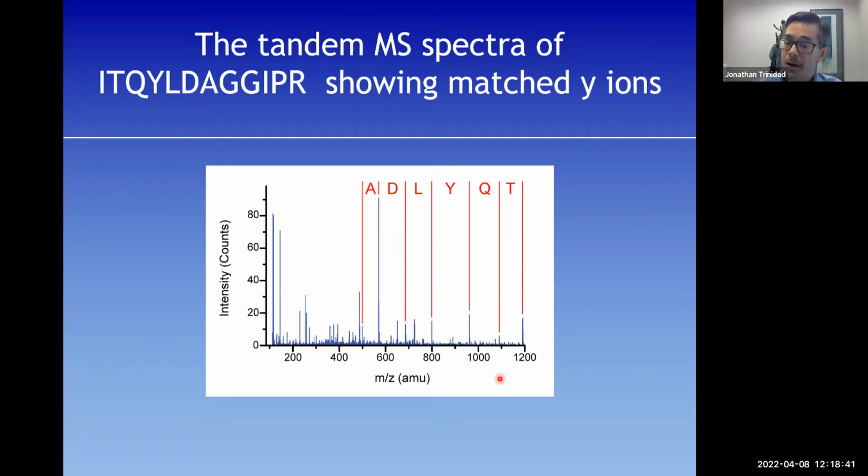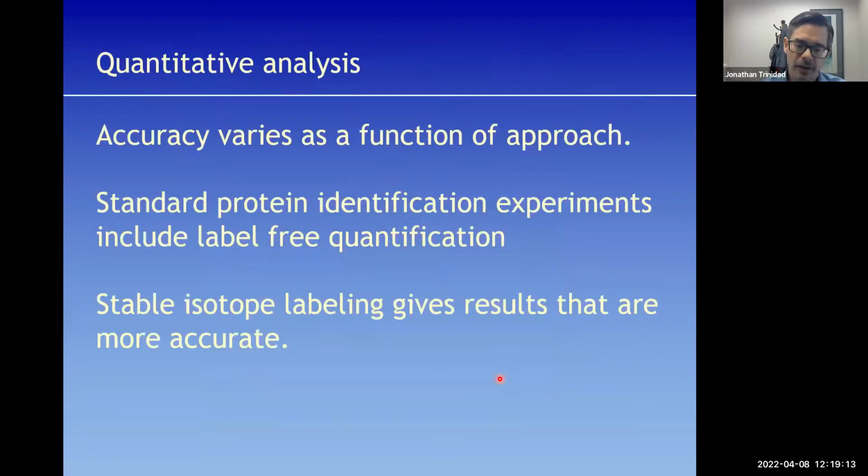And then because we know how the peptide is supposed to fragment in theory, we can generate theoretical spectra for all of them and do pattern matching between the actual observed spectra and the 50 or so theoretical spectra and figure out which one is the best match. Of course, you'll always have a best match. That doesn't mean it's right. So we do some secondary statistics to say how much better is this match than would be expected from the decoy distribution. And we get statistics on the confidence of our hits. All right.